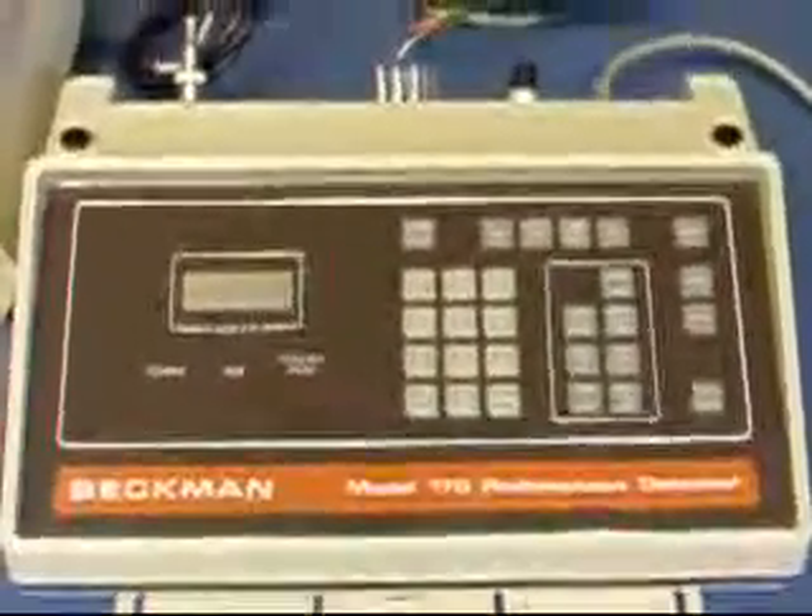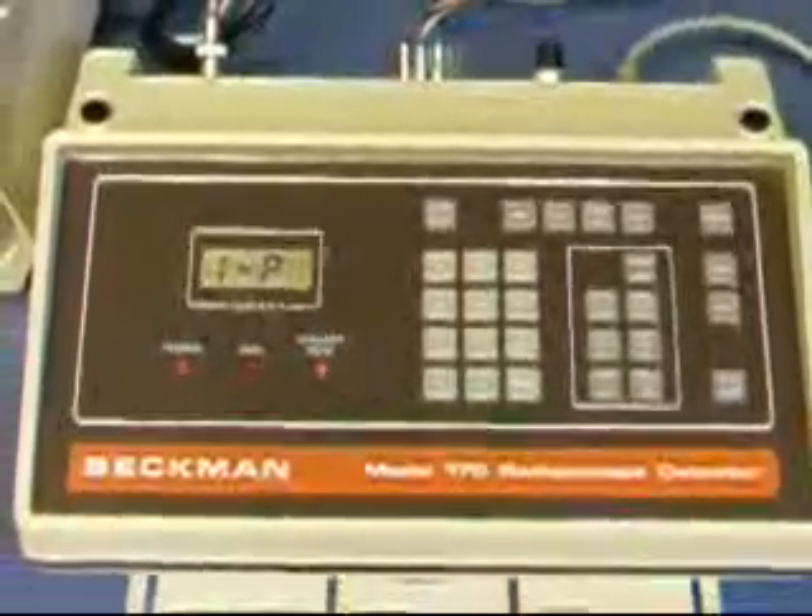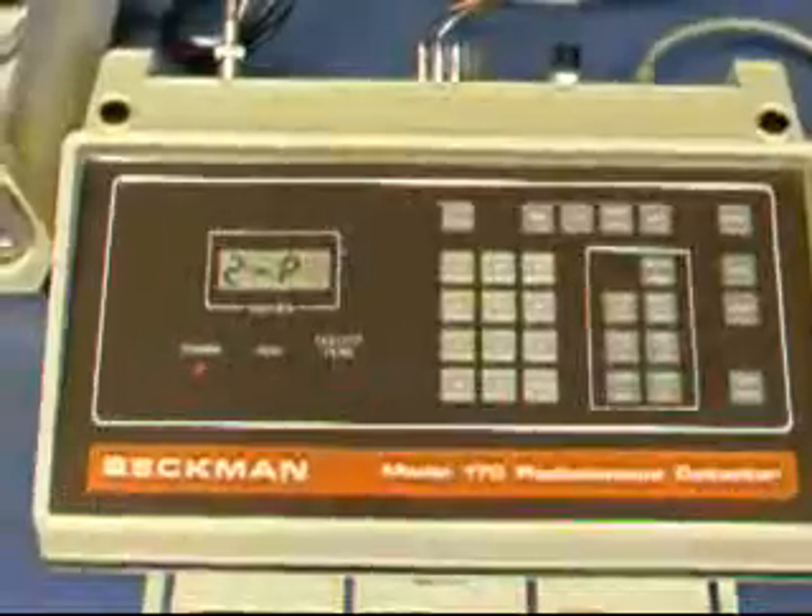Okay, this is what it looks like when we plug it in. A little boot-up sequence.